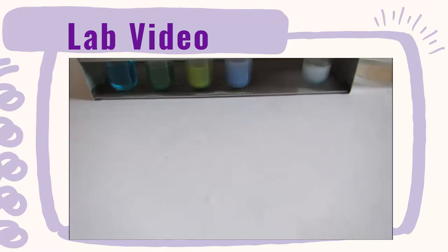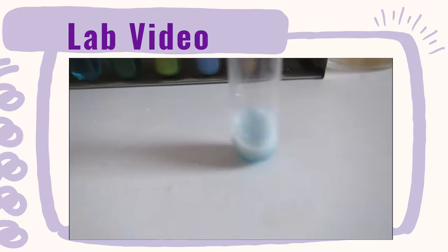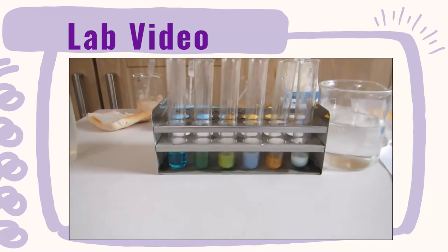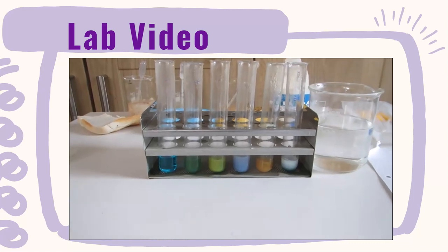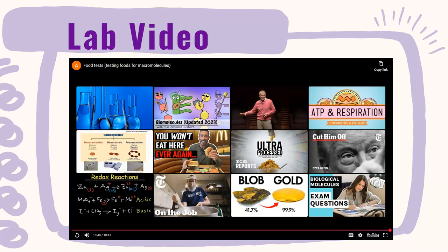So now on to our bread. Do you think this has sugar in it, or reducing sugars? On to our cheese spread. Do you think this has reducing sugars? Our banana then, do you think it has reducing sugar? And finally, in our milk, do you think there is reducing sugar?